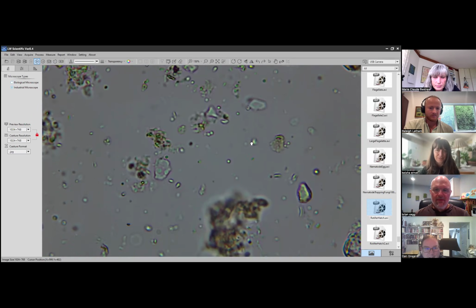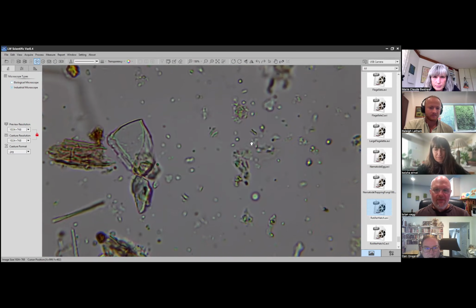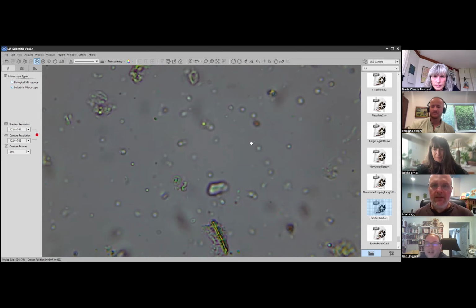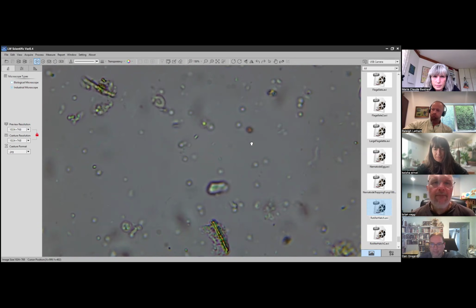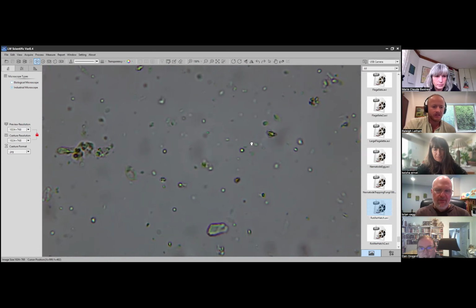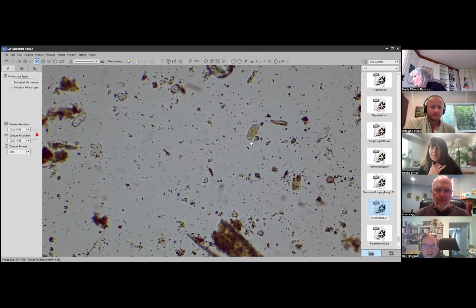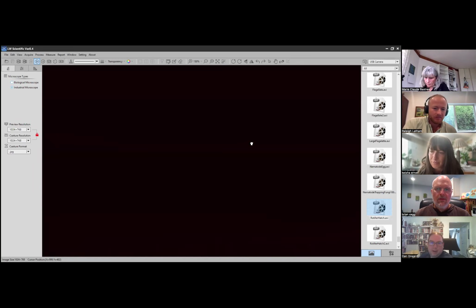Was trying to find some. There were quite a few testate amoeba, again Arcella. How old was this compost, Dan? I'm sorry if I missed it. It's from the spring, summer. It's all been combined into one mother pile, within this last year. So it seems like it's almost a 6 month plus old pile. That's great. I'll zoom back out a little here, see if there are others. But yeah, we see some amoeba.